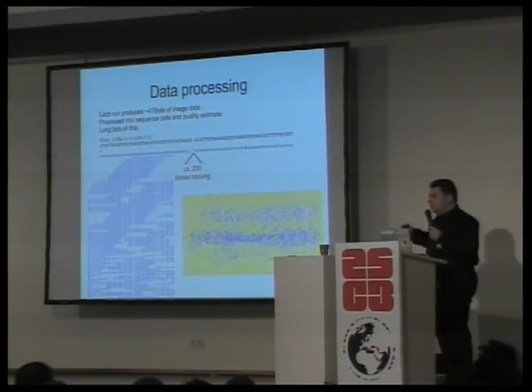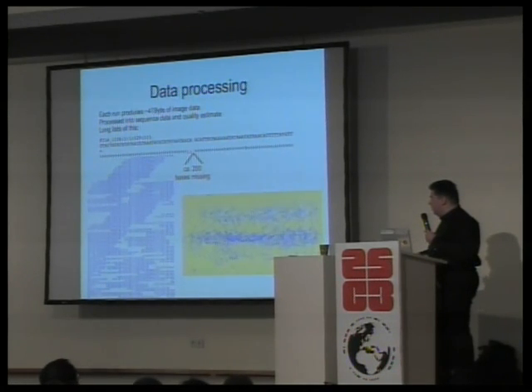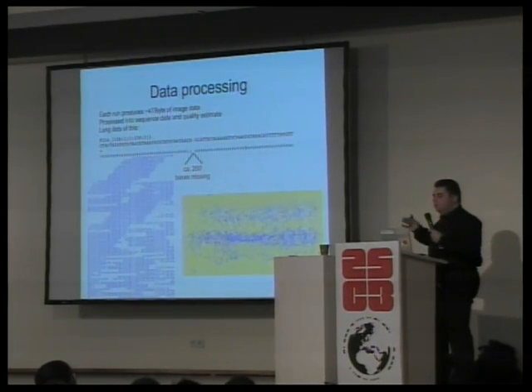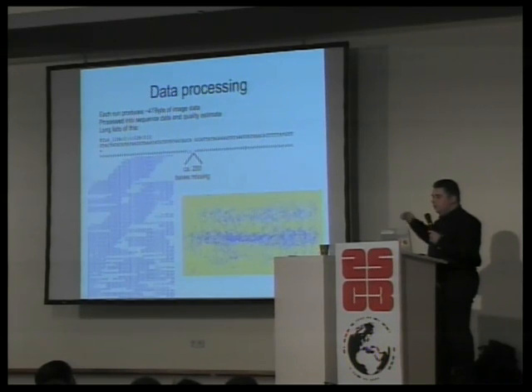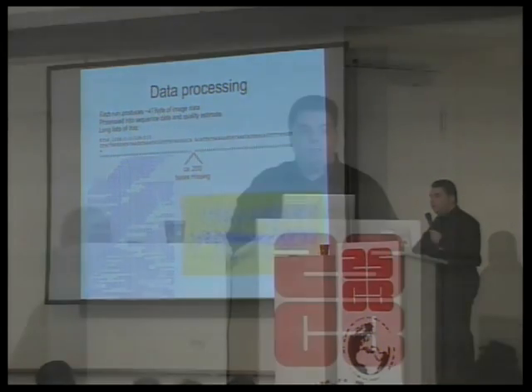They were fitted to a reference sequence, and the blue means they are a perfect match, and the red means they are not matching the reference sequence at that point, but it's the best match that could be found. So when you see the red clustering at this position, then you can assume very safely from that that this base in this sample is different than the one that was used as a reference.